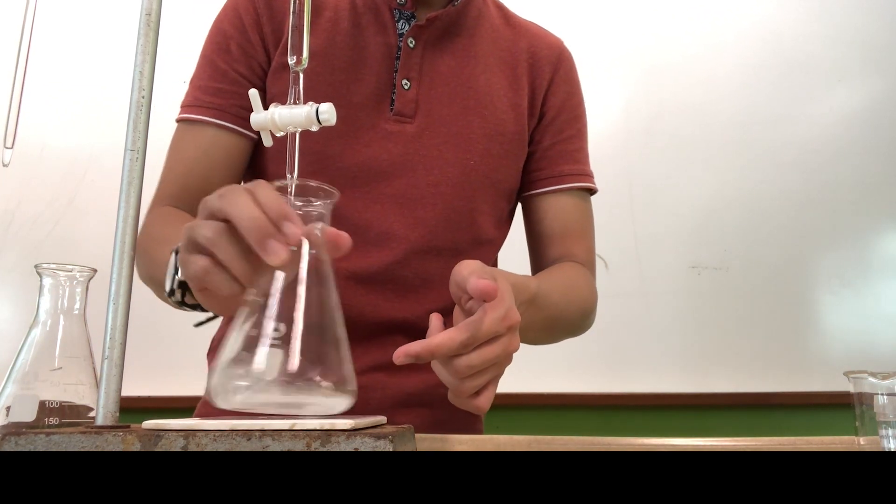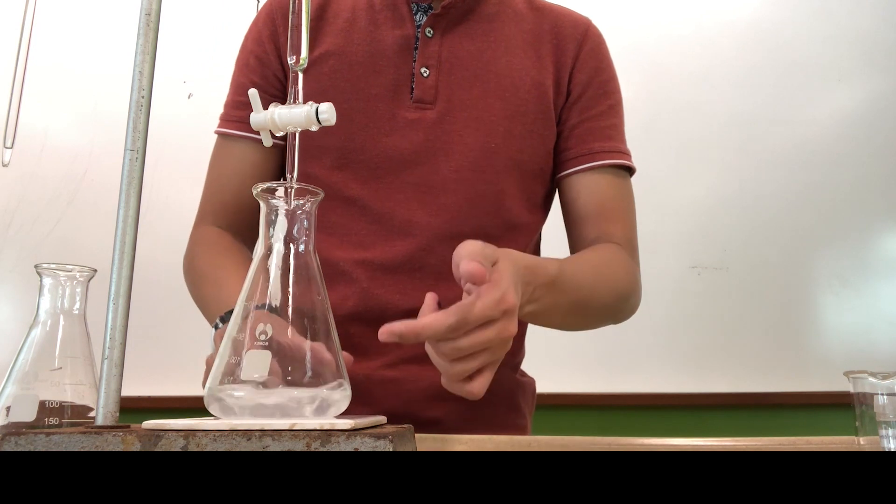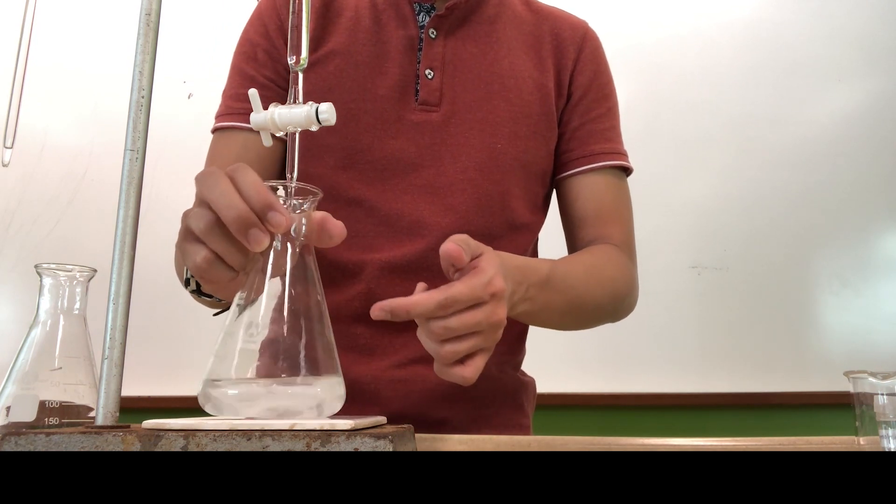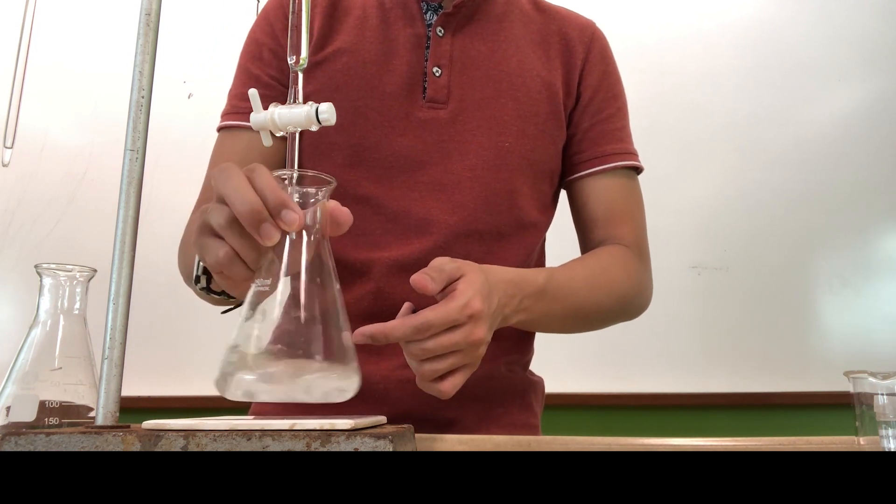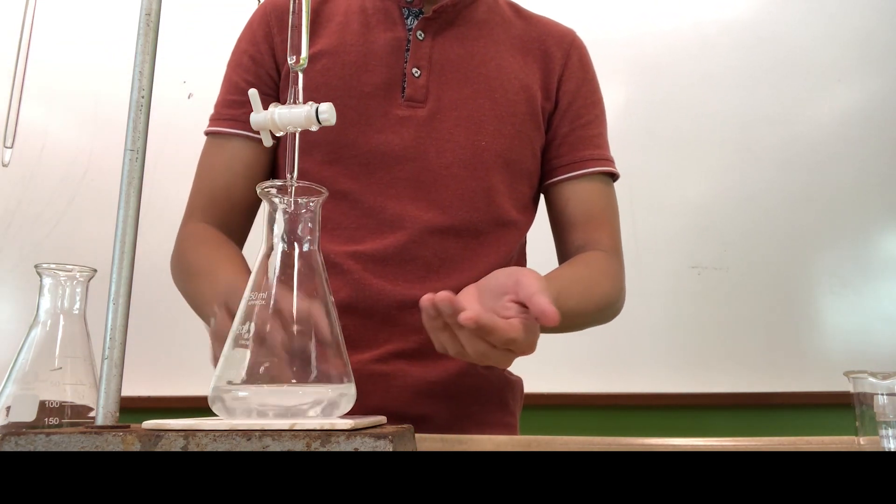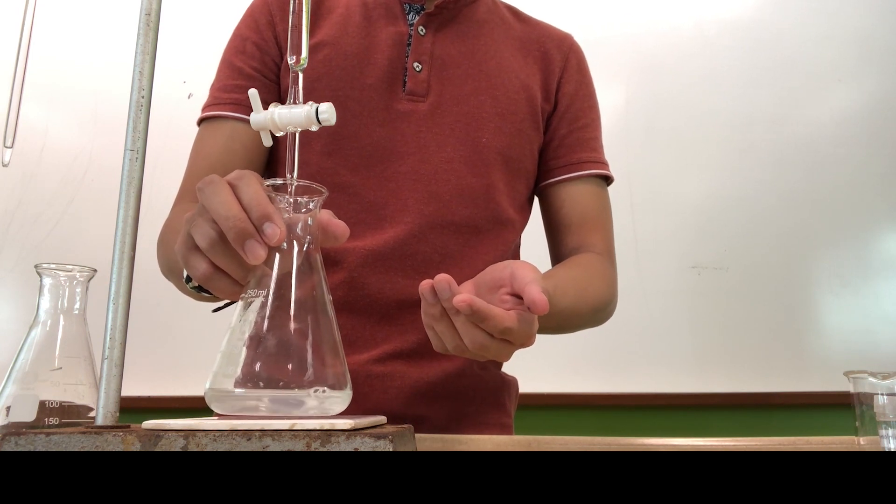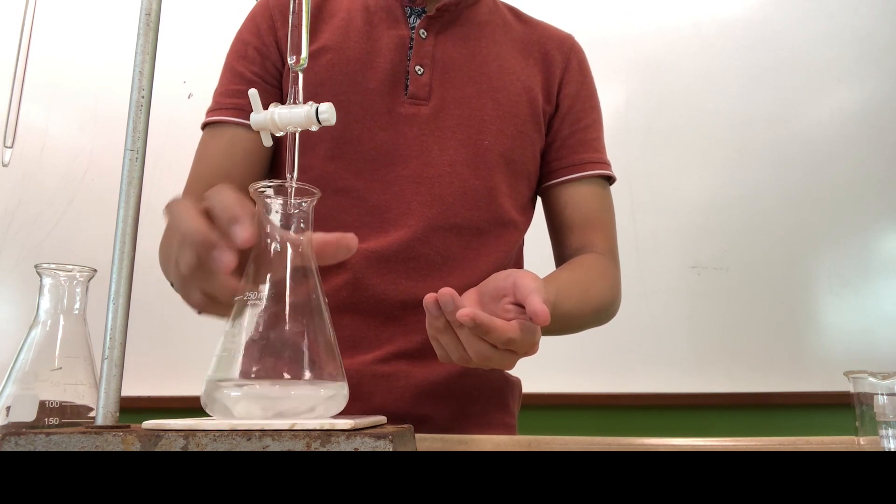As you can see over here, this is what we mean by dropwise, whereby it takes a while for each drop to be formed so that you can swirl, observe, before you let the next drop fall down. Take note of how much should the knob be turned, the angle of it. Then now feel free to add in your solution as per normal.